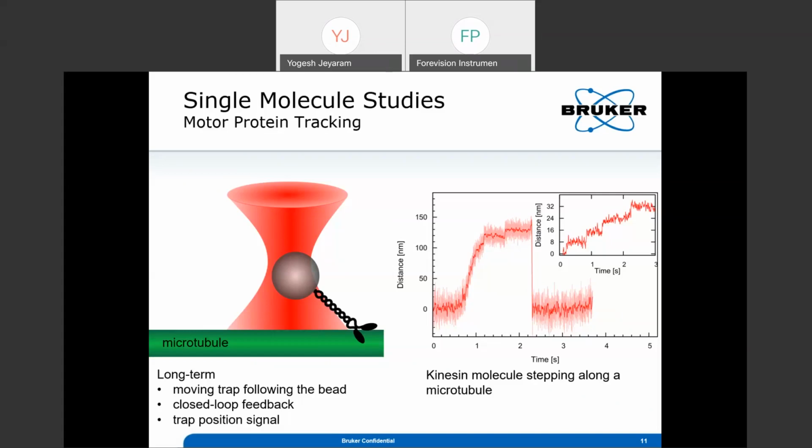And beads also have molecules on top of them, which attract themselves to the DNA. So you trap the beads, you move them to the DNA side, like in the fluidic chamber that we showed, and then you wait for a DNA to come. You control the flow rate so that it's something reasonable, right? It's not ultra fast. And then you hold it there, and it will automatically attach to the DNA. Now you have DNA attached to one bead. Then you trap another bead and bring it there, and you can attach it to the other side of the DNA as well.